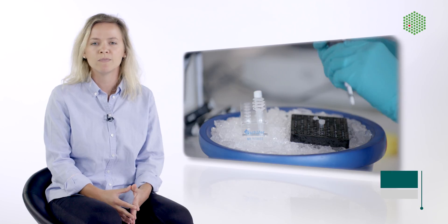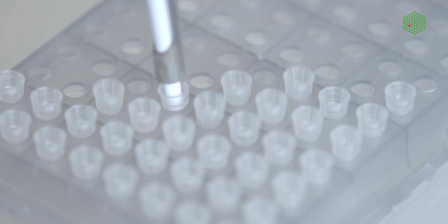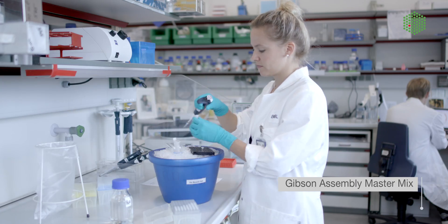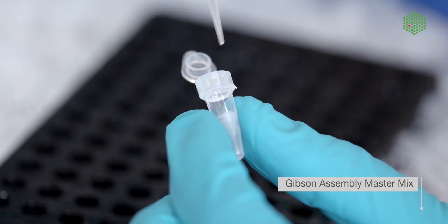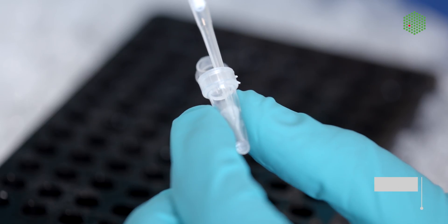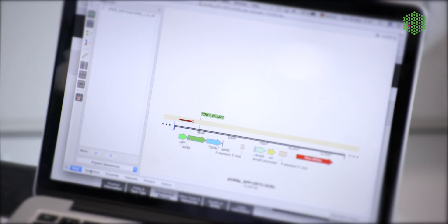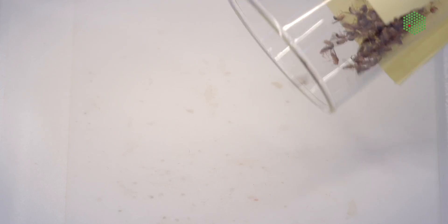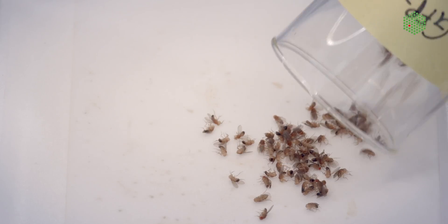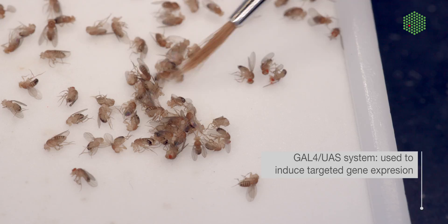We are now going to explain the major steps of how you can implement optogenetics, and we will show you how we perform an optogenetic experiment on the early fly embryo. We start by using the Gibson assembly cloning technique to clone the protein fusion constructs into regular UAS vectors that allow for GAL4-inducible expression of the optogenetic fusion proteins in desired cells or tissues, in our case the early Drosophila embryo. In order to start transgene expression, transgenic flies are generated and crossed with specific driver lines that provide the GAL4 transcription factor.